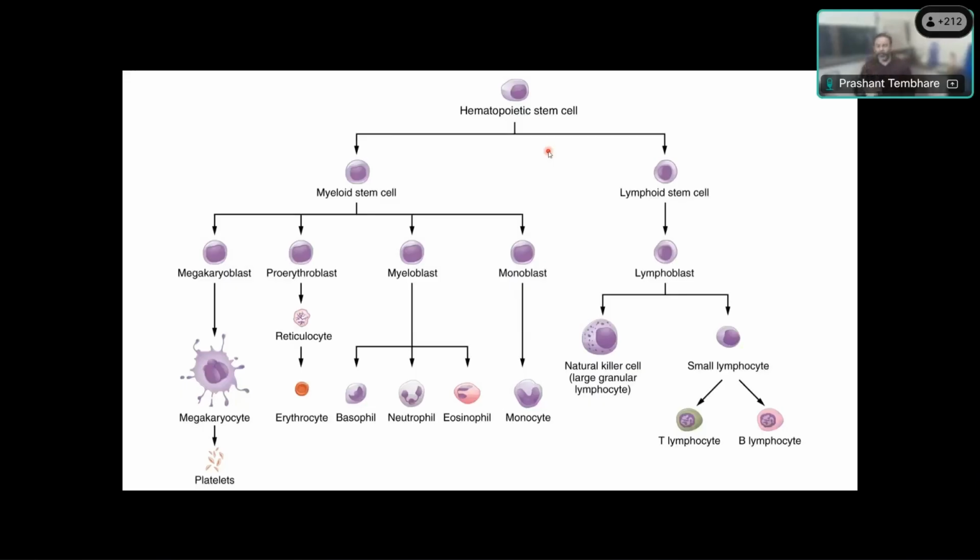It's like a window. When you look outside through a window, it allows you to see only the part of the outside world that is visible through it, and not the rest of the world, even though it is there. In the same way, gating allows you to focus on a particular population based on the marker or combination of markers where you identify and put the gate, and then you study that population. I will show you with an example.